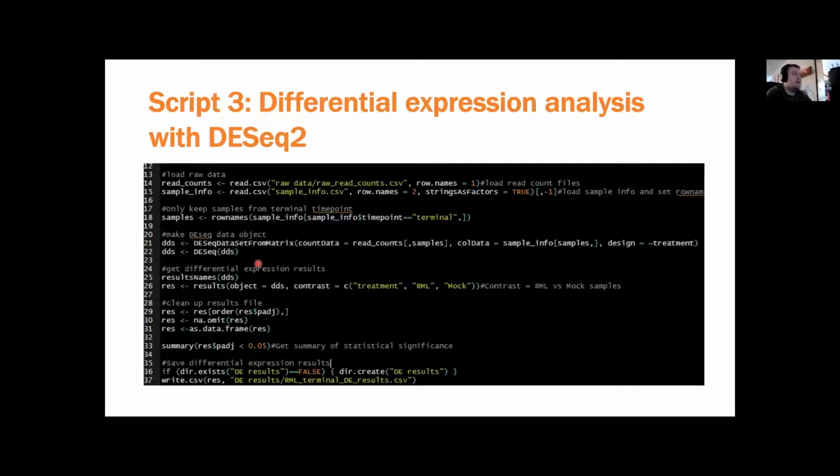Keep in mind that based on the PCA plot, this might not necessarily be the best way of normalizing the data for differential expression testing, but it's the most straightforward way of doing it for the purposes of the tutorial. It's also the way that was done in the original paper, so we'll stick with it for now. But I just want to emphasize that when you are analyzing your own data, the way you go about normalizing for differential expression is something you'll need to think about.